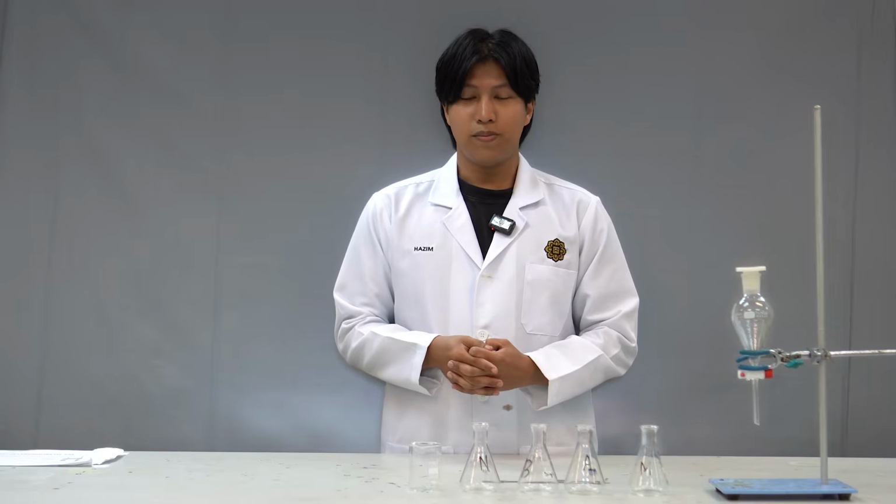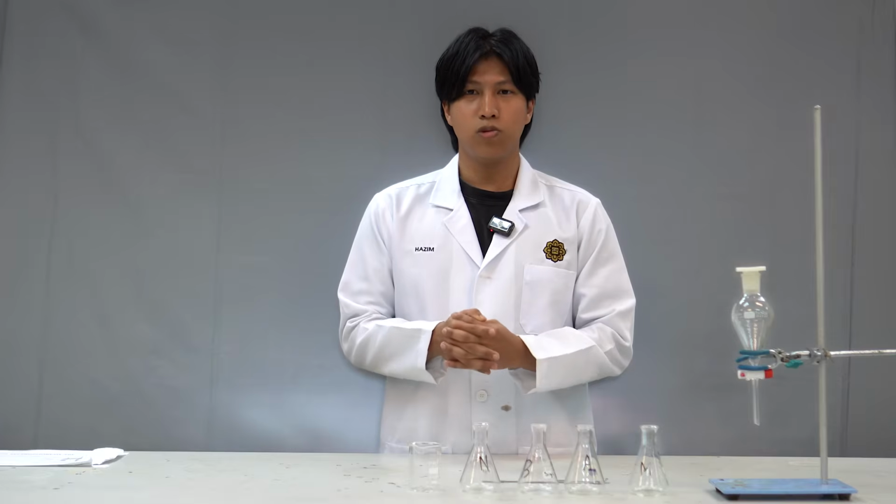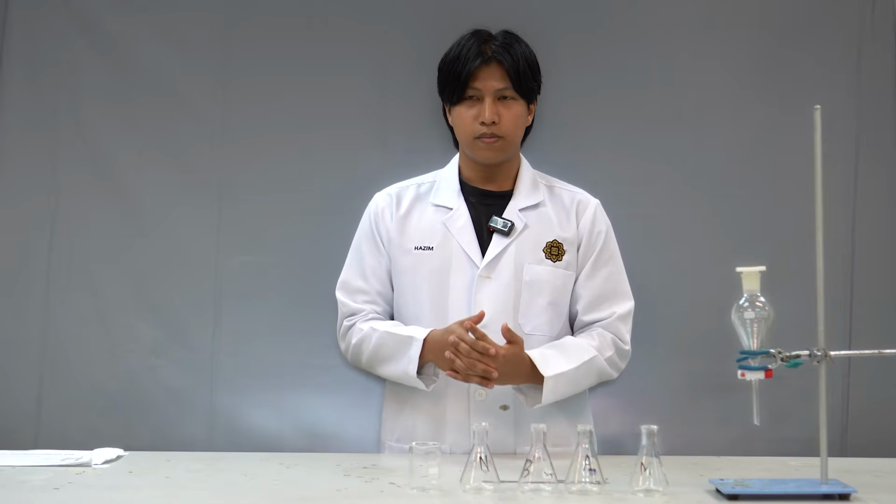Liquid extraction is a type of separation to separate chemical compounds or organic compounds that differ in solubilities into immiscible liquids. So liquid extraction involves extracting an organic compound from an aqueous solution.